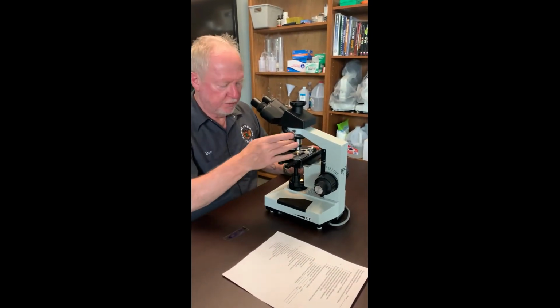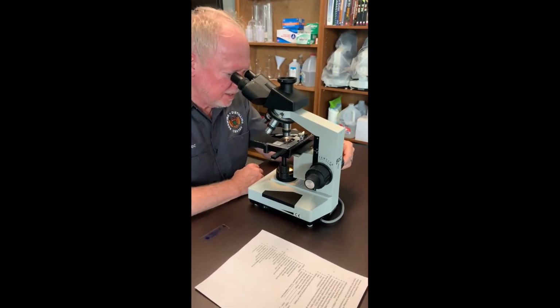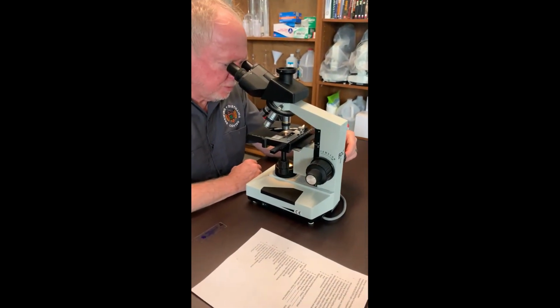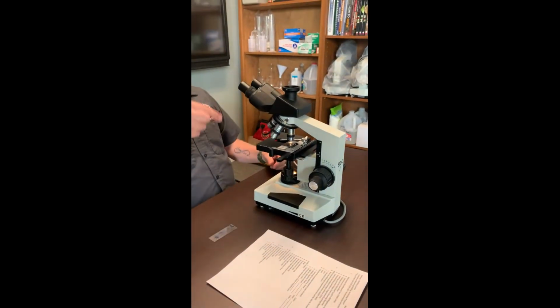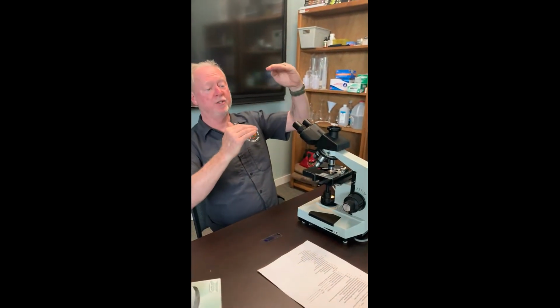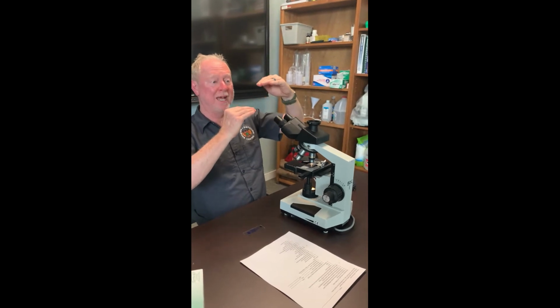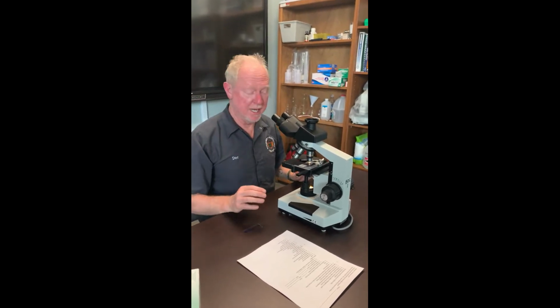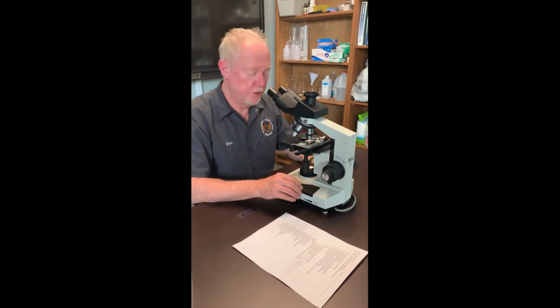I'm going to move to the higher objective and I can't quite seem to get it in focus. If it takes you more than 20 seconds to get it into focus, you may have actually gone well past the focal point as you're turning it, and the more you turn it, the more and more out of focus you get. So a lot of times, if you can't get it into focus after 20 seconds, you're probably not going to.